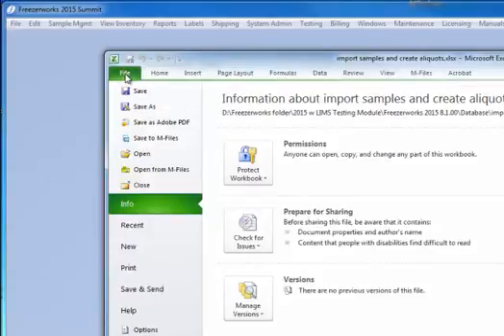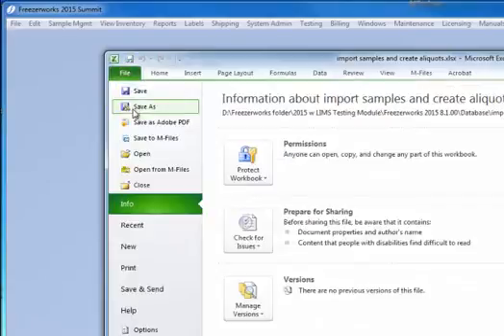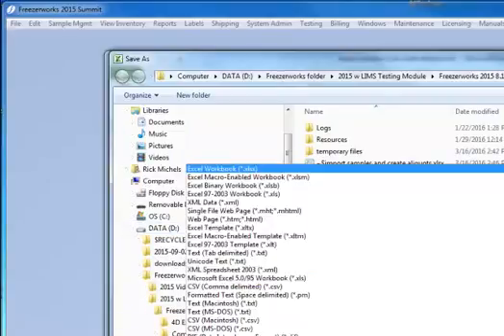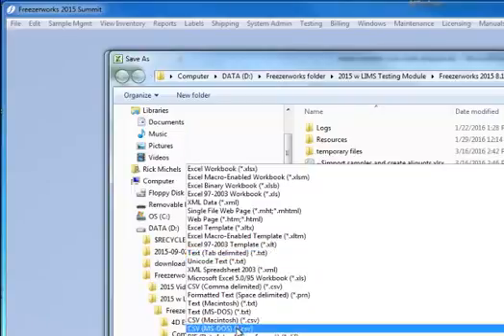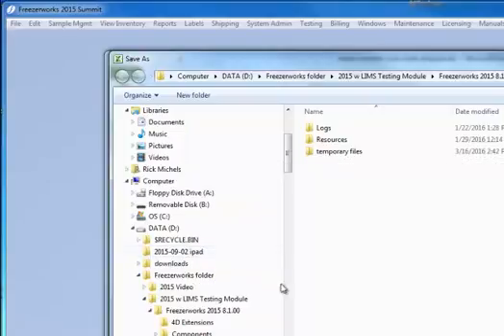Now, it's important to remember that in Freezerworks, we import CSV and TXT files and such. We do not import Excel files. So the step you'll have to do if you have an Excel file is save it as one of those two options. Come over here, you hit the save, and you select save as type, and here's an option. We can do a tab delimited or CSV comma delimited file.